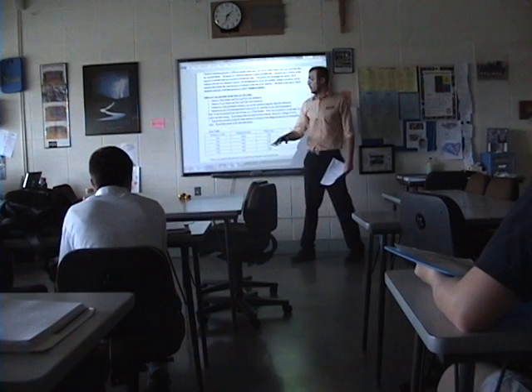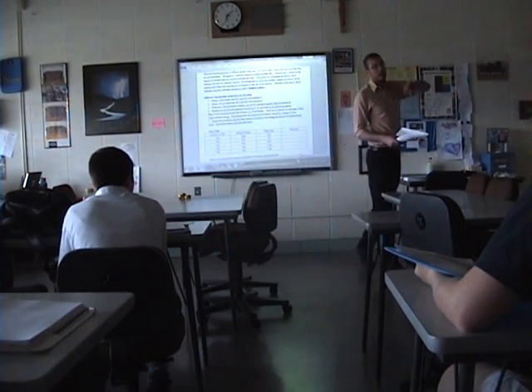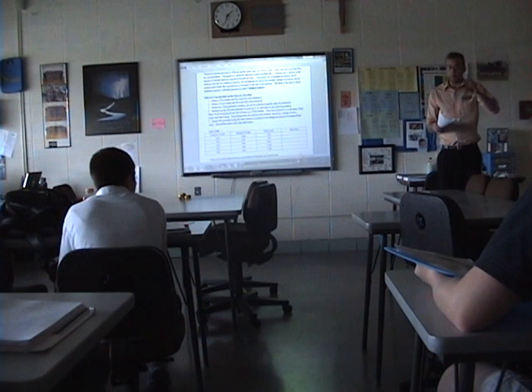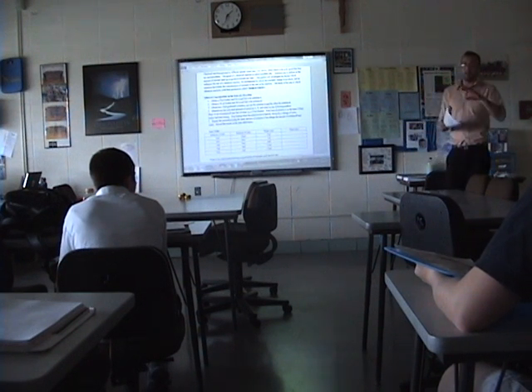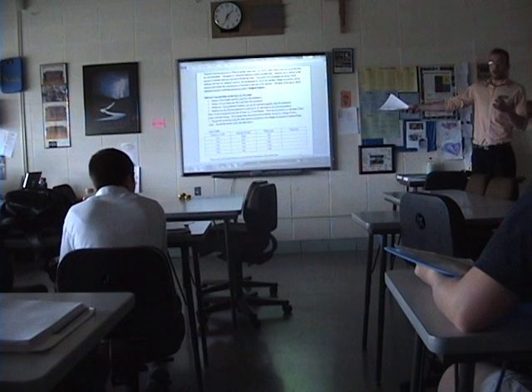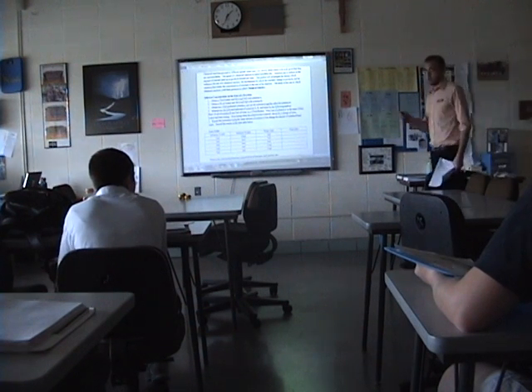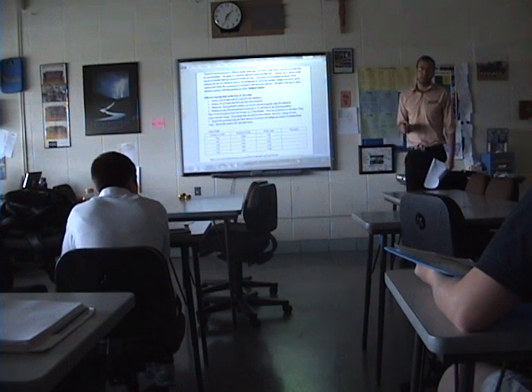And then you're going to take your 5 milliliters of solution A and pour it in. Now you can either start counting as soon as you pour it in, or right after you're done with it. It doesn't matter, but you have to be consistent for all 5 of them. So you're going to pour your solution A into your solution B and water mixture, and then you're going to record the time. And you're going to stop the time as soon as you see a color change.